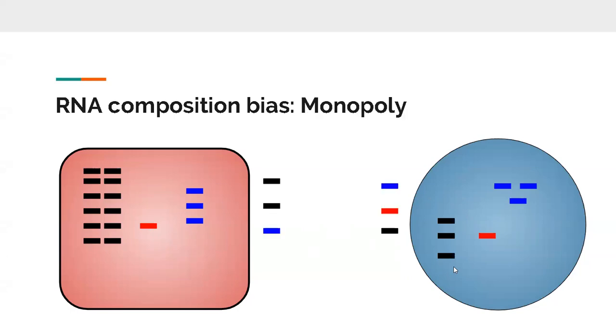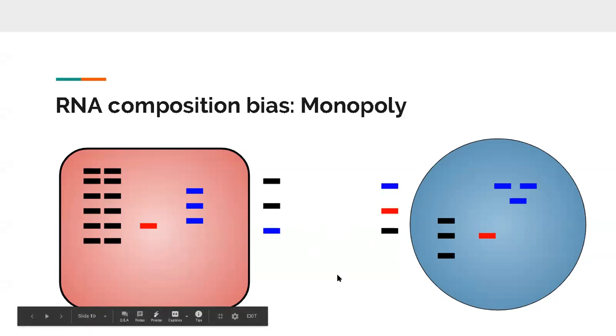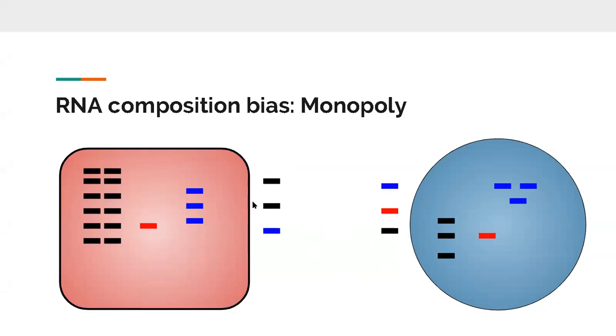But when you do that exercise of picking up three reads at random, what might appear is that there is a differential expression of even gene B. You will not pick up any red read count in the wild type, but you still might pick up the red read count in the second sample. So in reality, when there was only a difference in gene A, now it seems like there is a differential expression of gene A and gene B. Is this point clear?